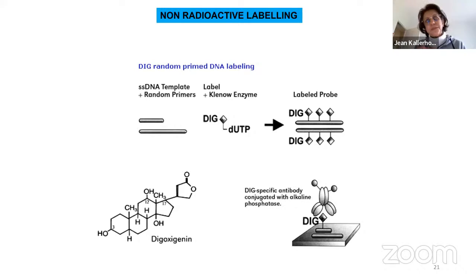So you will get very faint signals if your annealing temperature is not good, or if the elongation temperature is not good. And usually this is optimized because you approximately know the sequence of your templates, and you know the sequence of your primers.